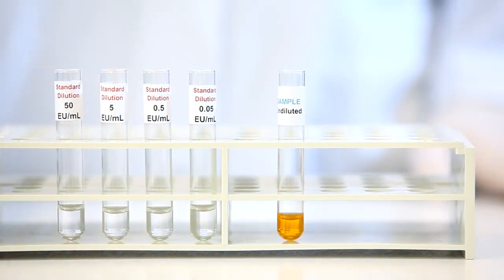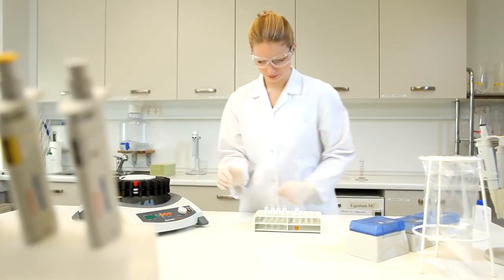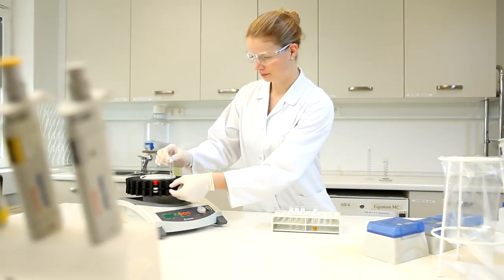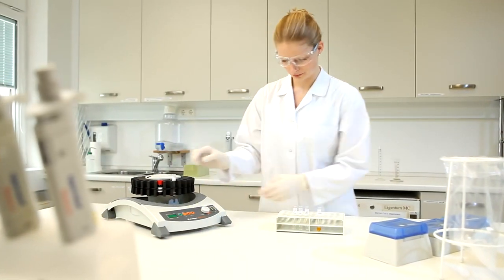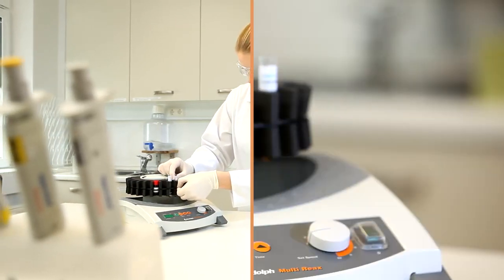In most cases, Endolysa enables the analysis of undiluted samples. For a highly concentrated sample or a particularly complex sample, a dilution of 1 to 5 in endotoxin free water is recommended.